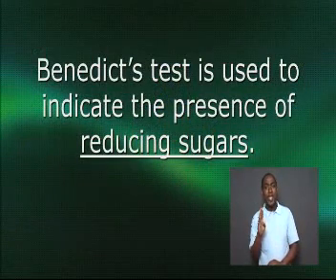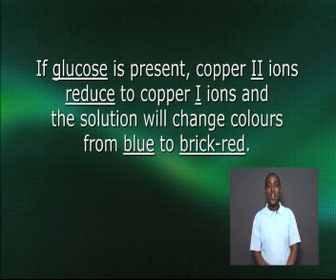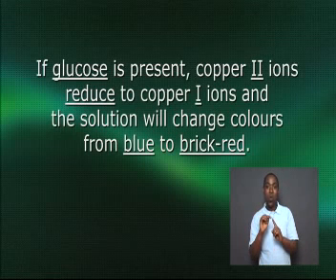Benedict's test is used to indicate the presence of reducing sugars. If glucose is present, copper-2 ions reduce to copper-1 ions, and the solution will change colors from blue to brick red.